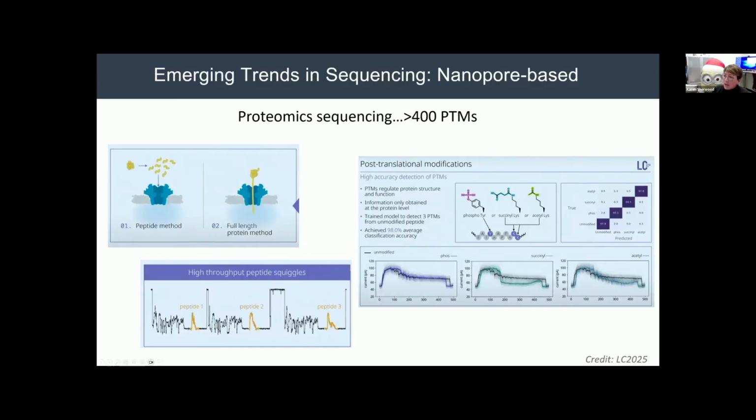They've actually started producing some early release data. You can see that the squiggles, which you might be familiar with, have these very familiar profiles where the peptides come through, with each end being a DNA barcode of that peptide. Again, very, very early days, but keep an eye out for some of these in 2026.